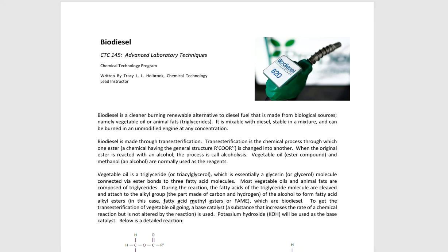And I'm getting ready to tell you that this biodiesel lab is a whole lot of box, because there's tons of different things that you're going to have to do on the inside in order to get this lab completed. So not only are you going to have to wait for days and days, but there's going to be multiple tests that happen after the fact for you to test the quality and the purity of the biodiesel that you have made in our laboratory setting.